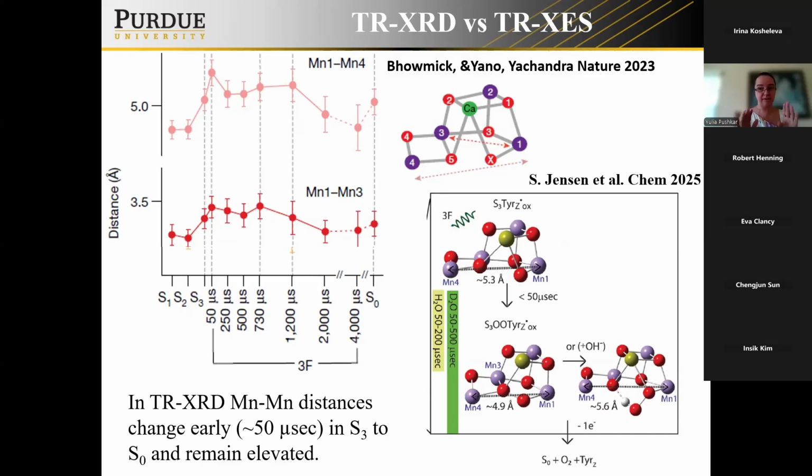So nothing happens in your system, but at 50 microseconds, and here it's outside of the given error bars, you have a significant structural change. And after the structural change, this distance remains elevated above that level, like if I average those 3 points. Here, the same thing.